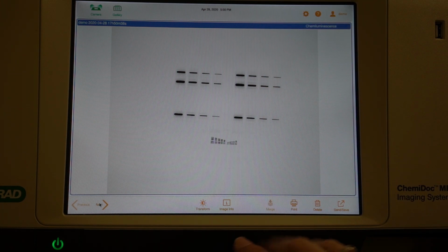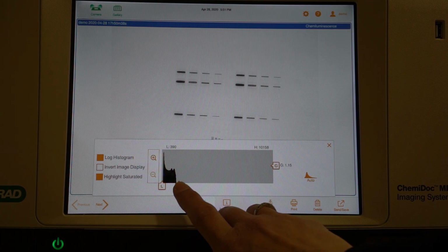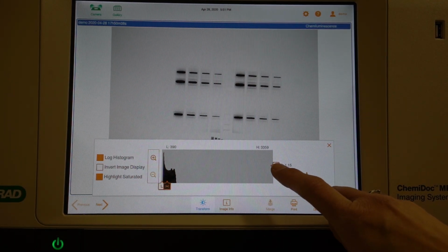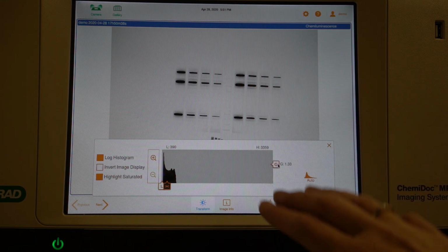In this view, you have the ability to use this transform button. So what this does is it populates these sliders, and all it's doing is changing how the image looks to your eyes. It's not changing any of the metadata or changing any of the actual image file. It's only how your eye sees it on the screen.